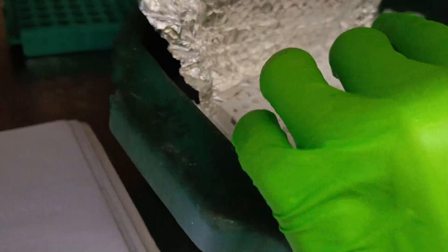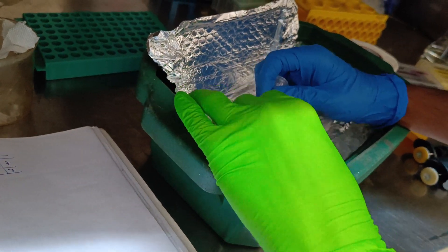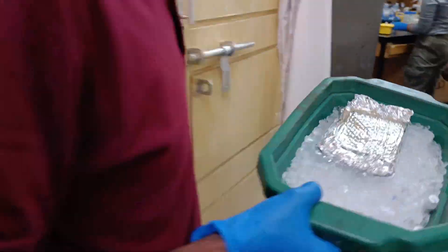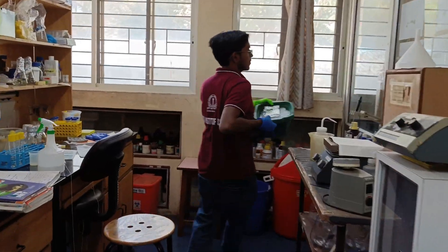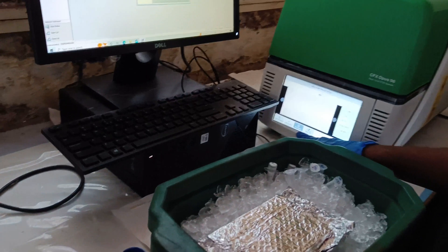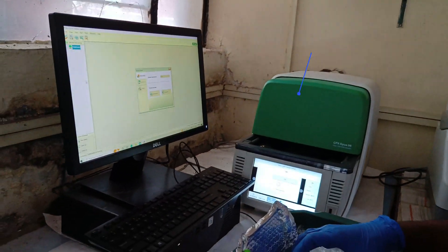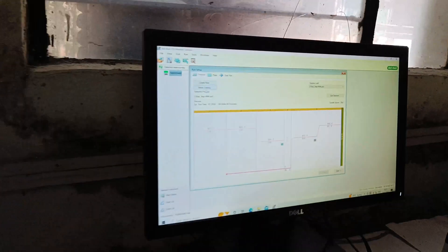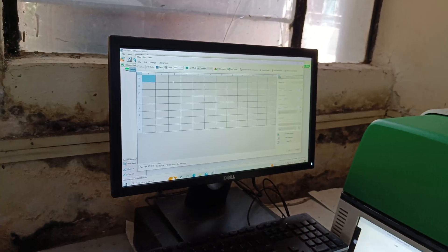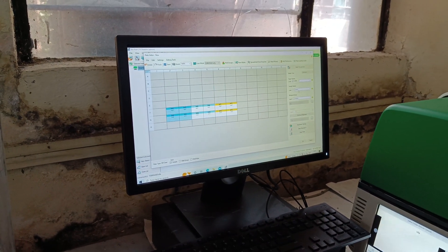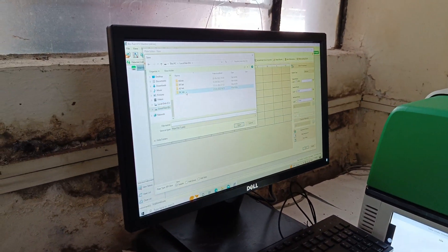After the sealing is done carefully, we start the RT-PCR. Here I am also entering the names of the wells into the computer software to make analysis easier.